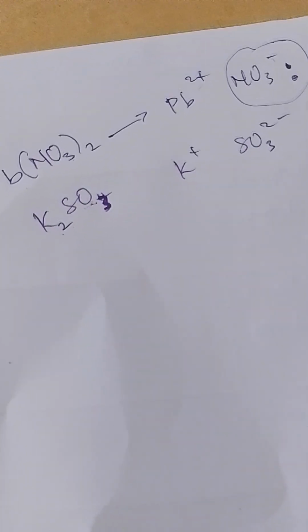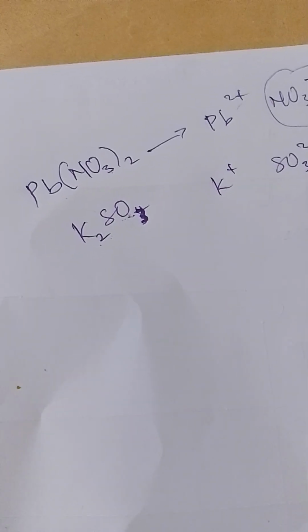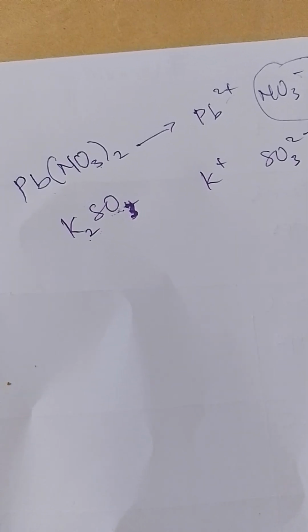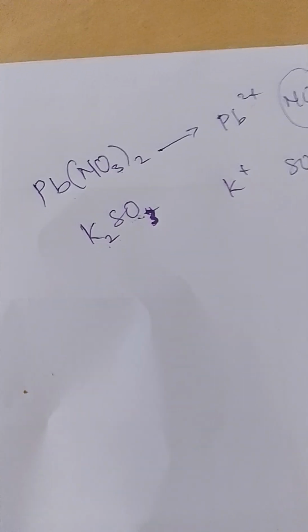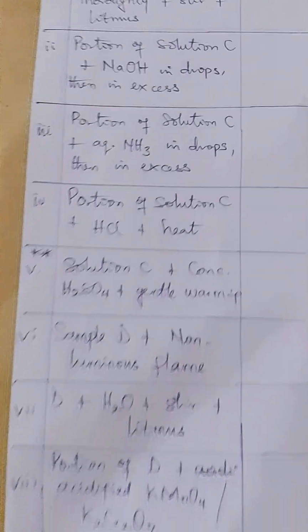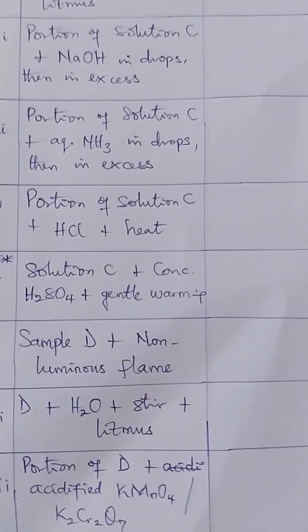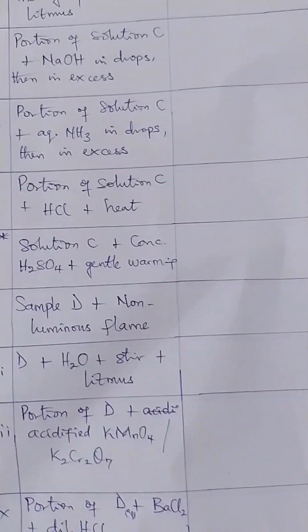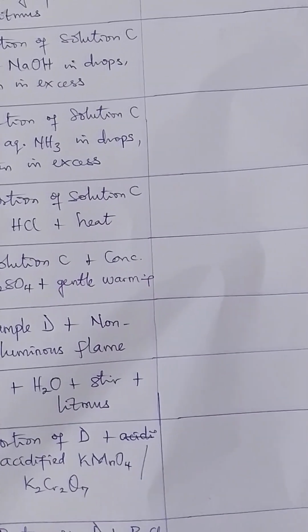And you know that NECO is very friendly compared to WAEC, in that they will give you the test. They will give you what to test for, or yours is just to write the observation and the inference. So in lieu of that, I've prepared this paper to have about 10 tests, and I'm sure the exam cannot be up to that. But what I'm going to give you here, you cannot miss it in your exams.